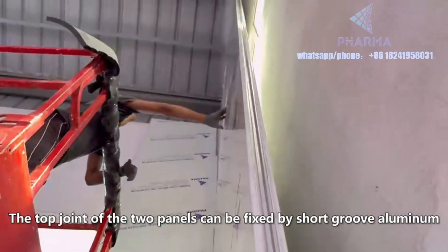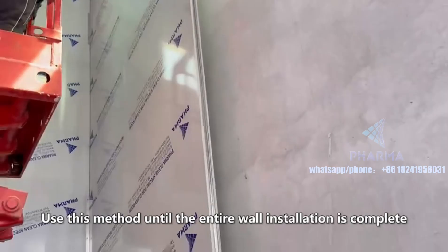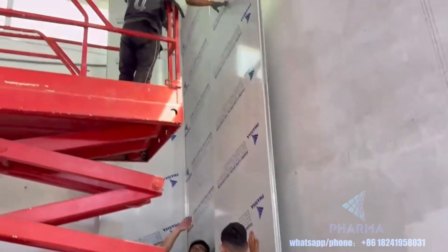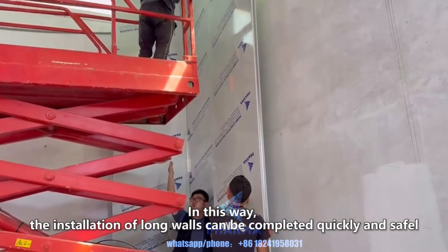The top joint of the two panels can be fixed by short groove aluminum. Use this method until the entire wall installation is complete. In this way, the installation of long walls can be completed quickly and safely.